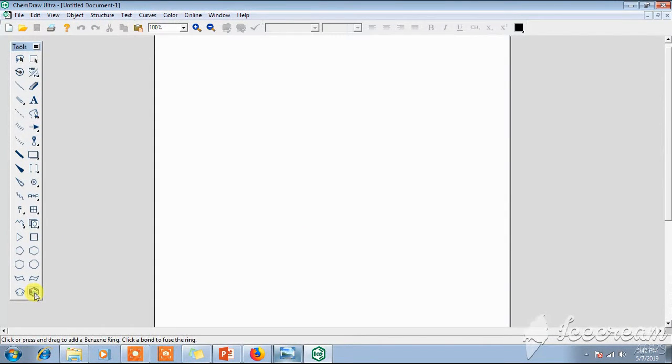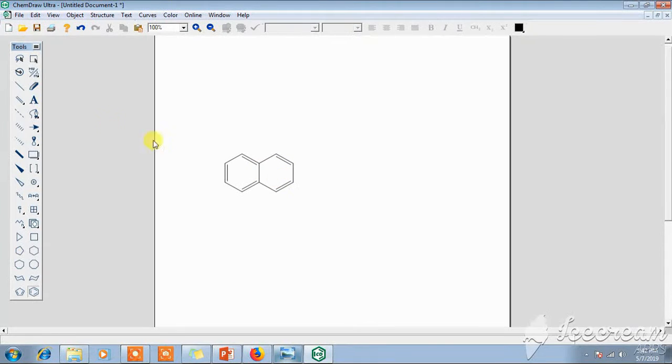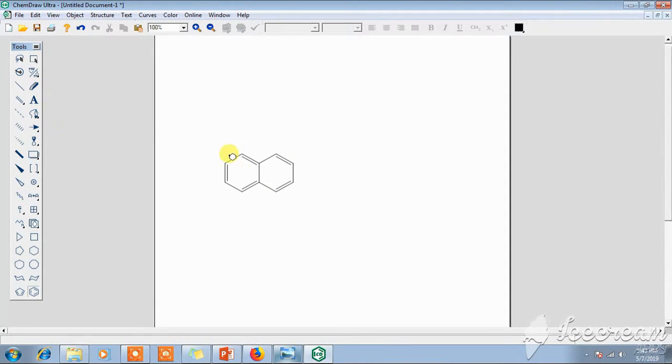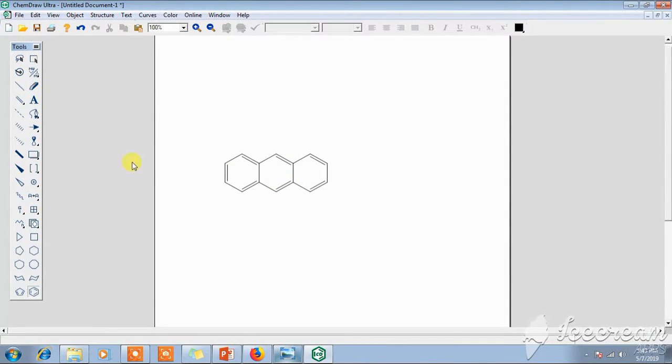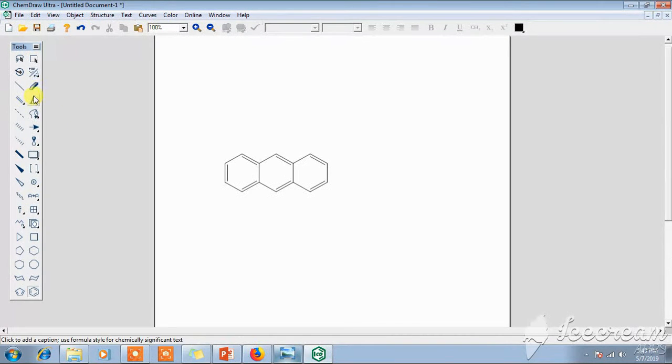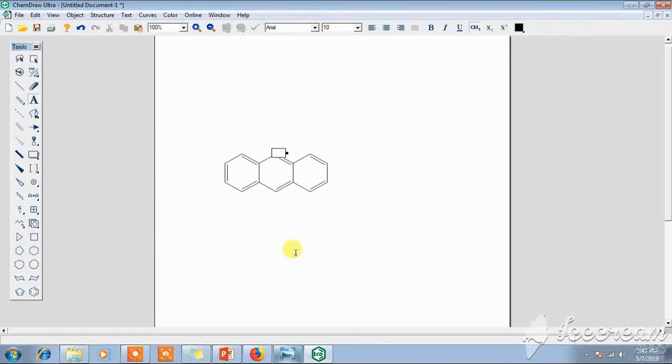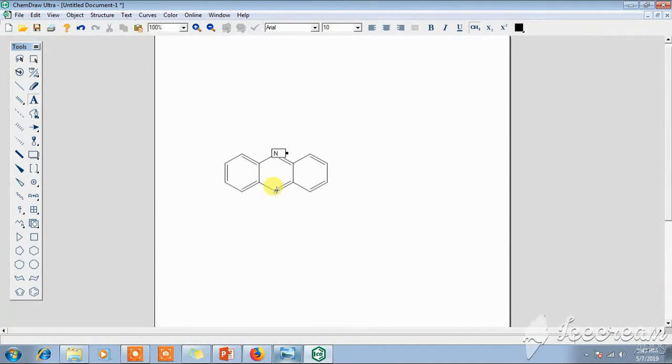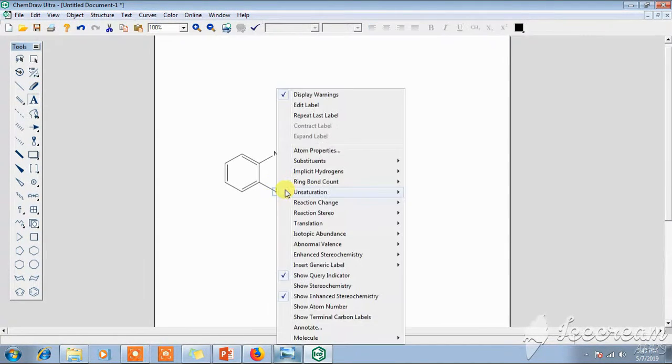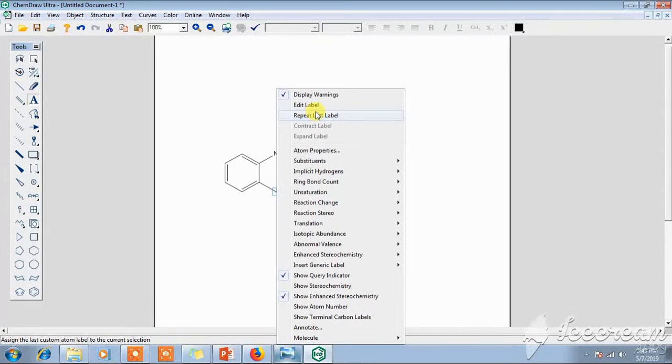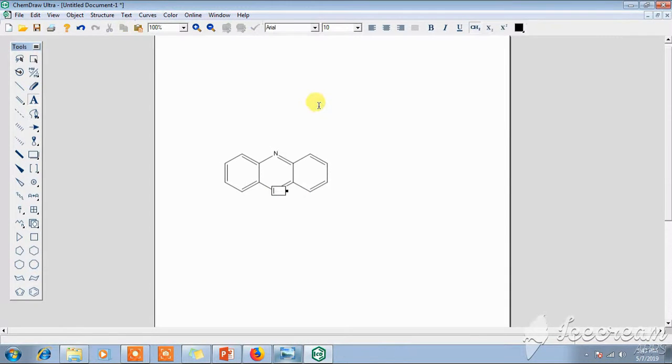Now draw the structure here, any structure. If you don't know their name, you can write their name. I will tell you how you can write the name also.